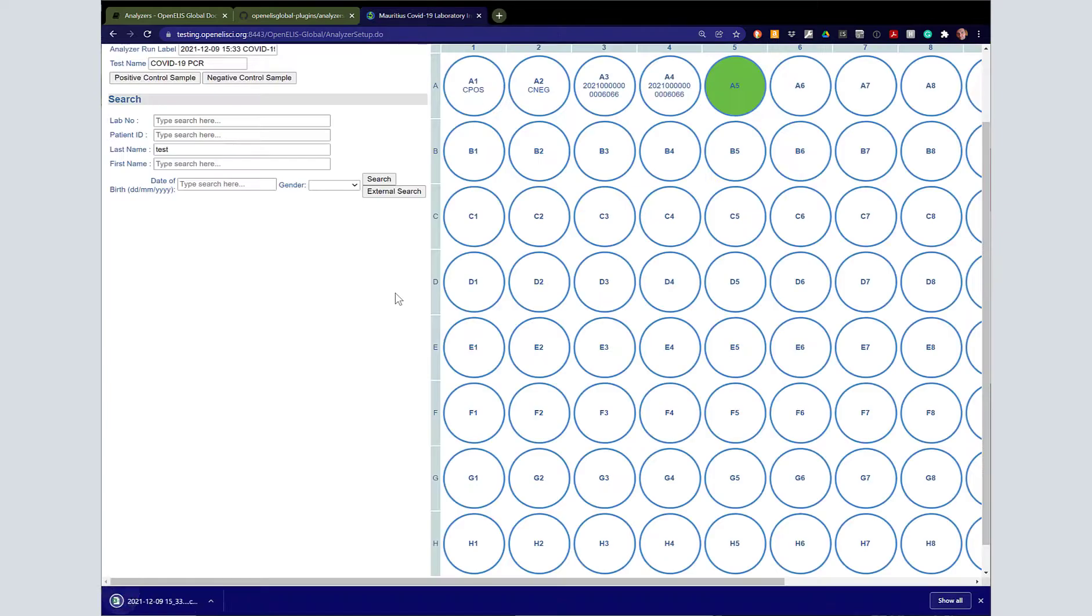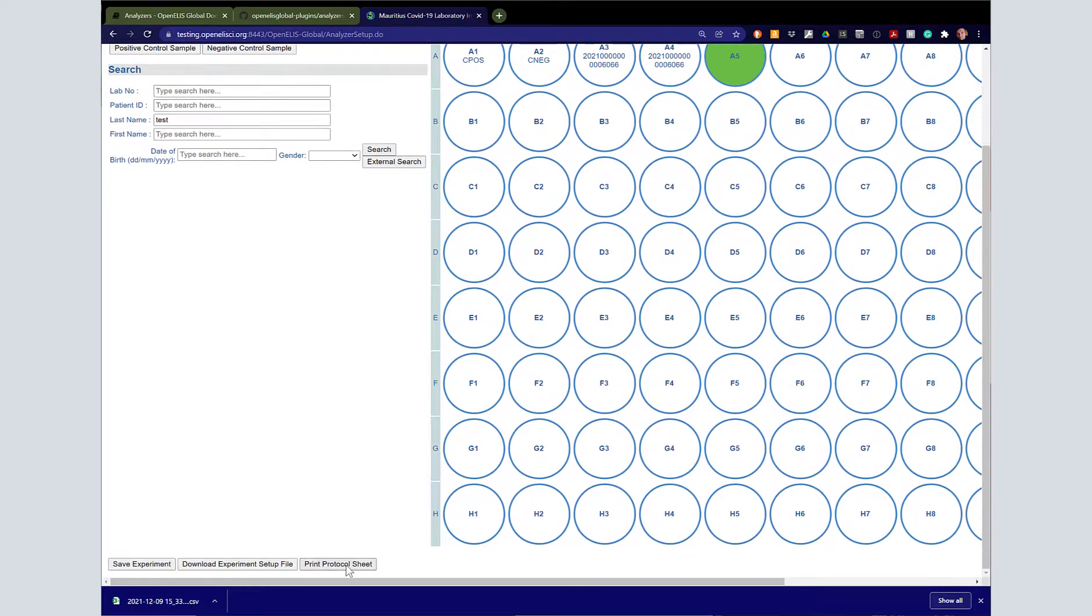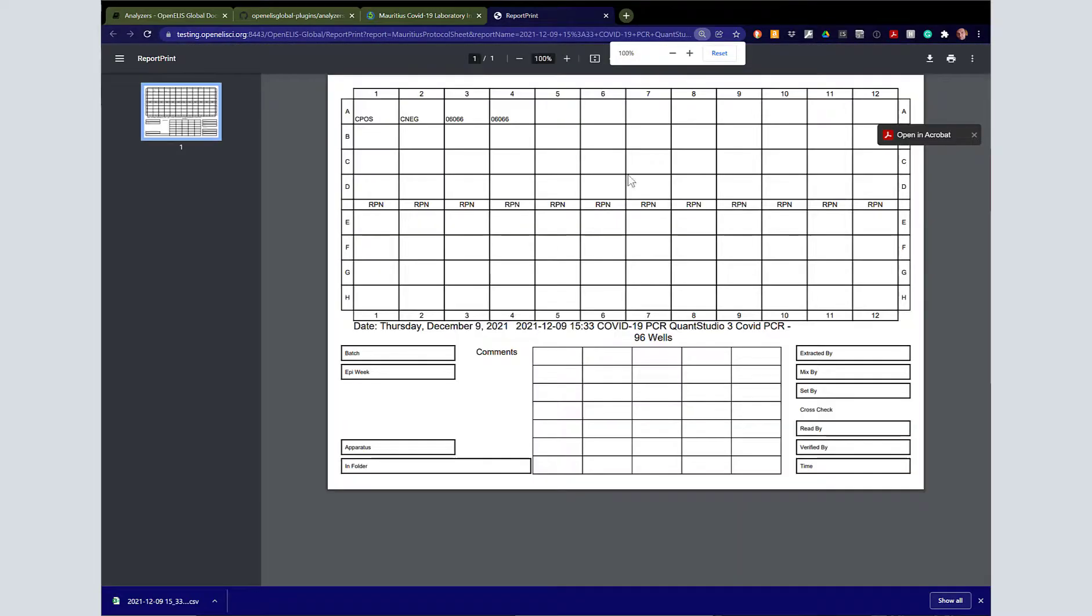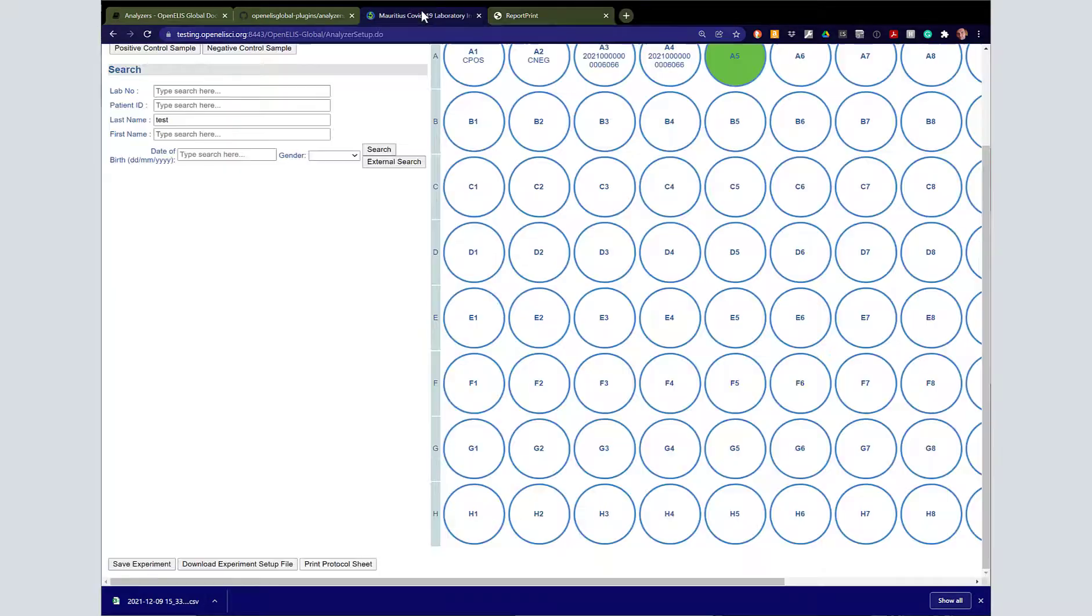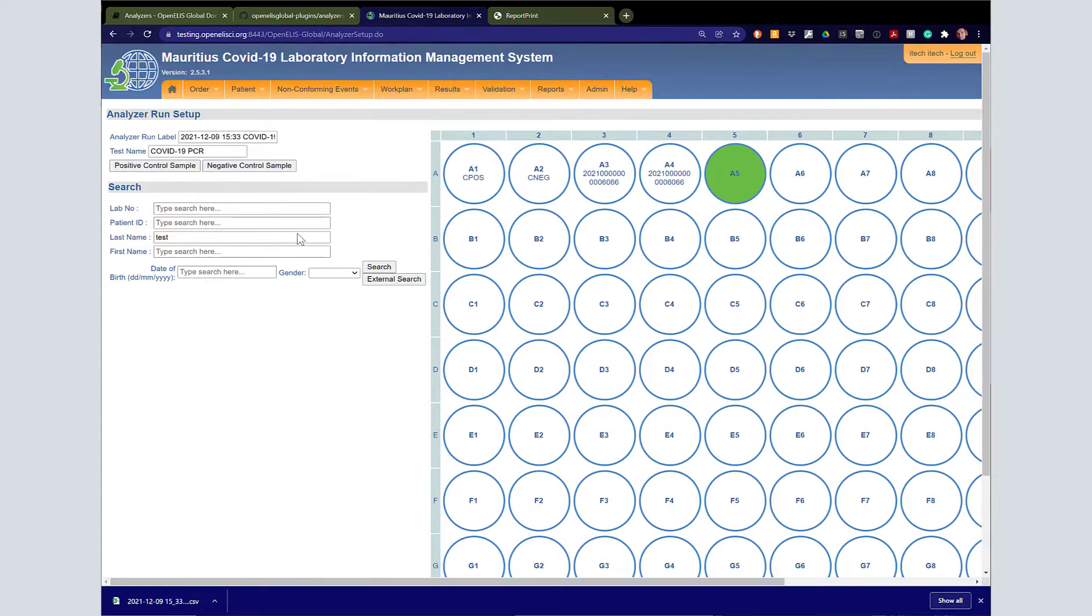I'm just going to save this somewhere that it can be accessed by the computer attached to the analyzer or put on a USB stick. Then specifically in the format for Mauritius, this is a printable protocol sheet that allows a paper log of this process.